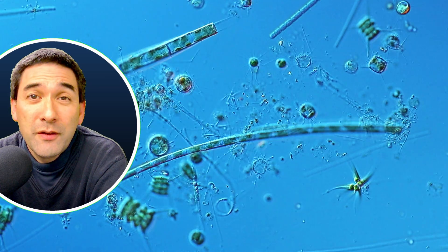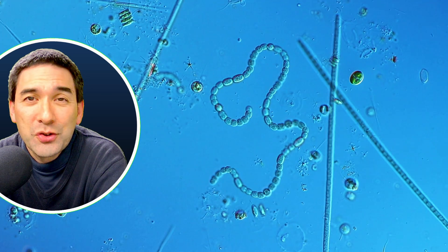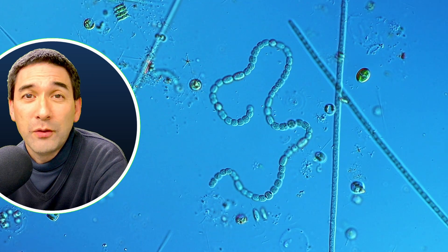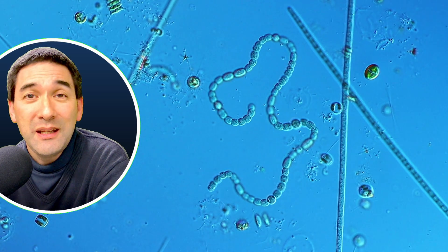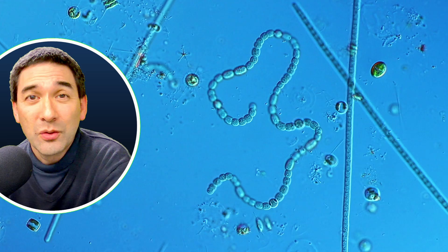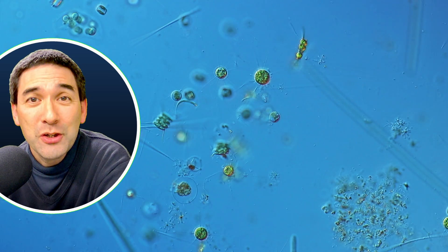I can imagine if I were to let the tube stand for a couple more days, maybe the algae are also going to reproduce more. This chain here of cells also seems to be a form of cyanobacteria. You can even see the so-called heterocysts — these are the cells in the chain that are a little bit different than the others. So we already see a little bit of something called cell specialization happening here.